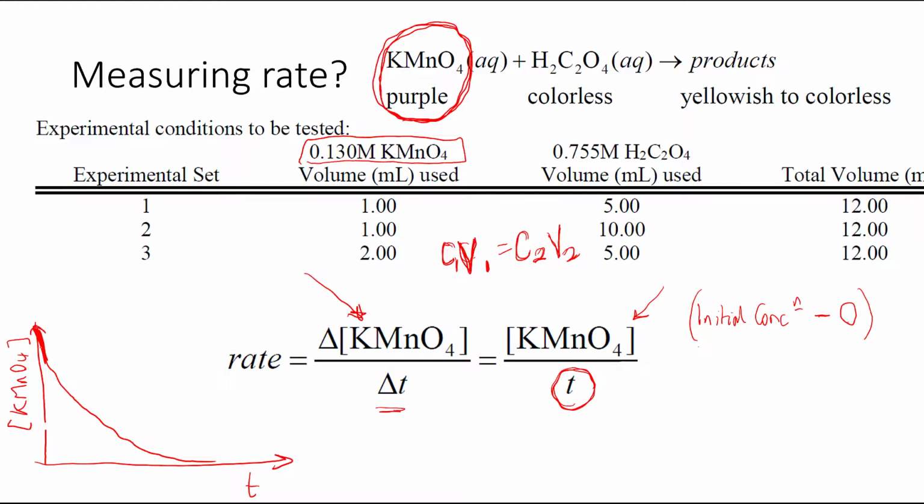We're not measuring an instantaneous rate, we're measuring a rate over all the time of the experiment, all the time that it takes to take that potassium permanganate concentration to 0, and we're going to find actually that the slope that we measure is our initial potassium permanganate concentration over the total time of the experiment. So the slopes in here are very different. The initial rate is very different to the slope that we would measure averaging over that entire experiment.